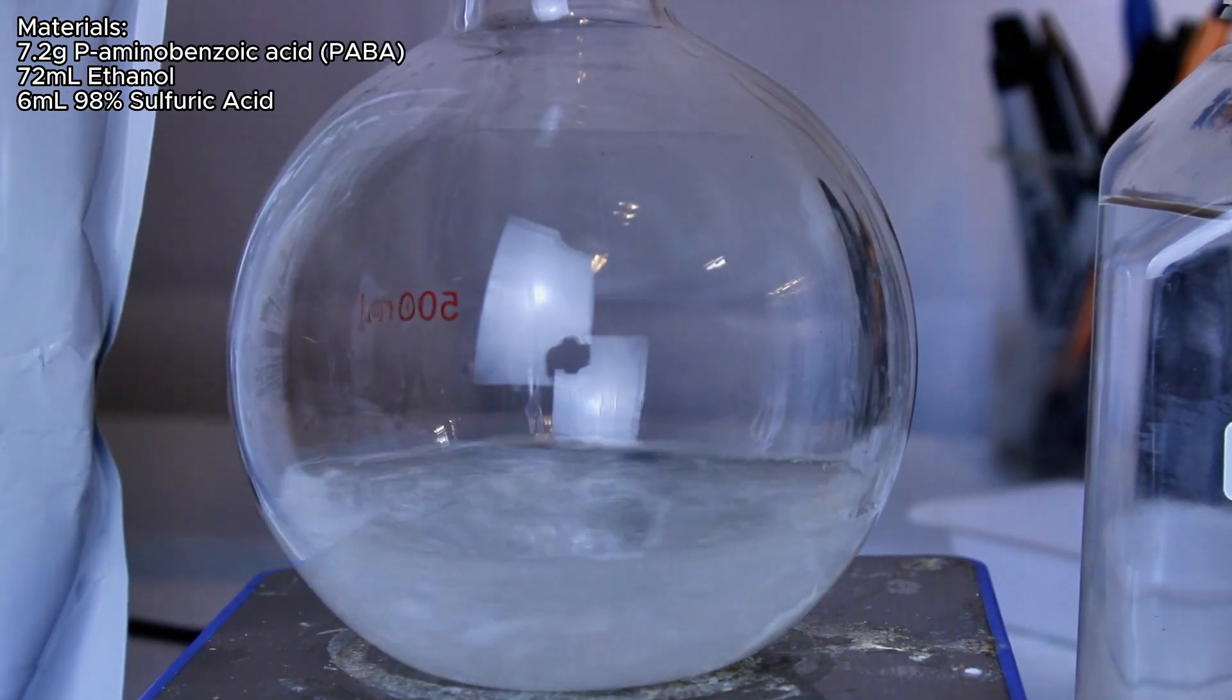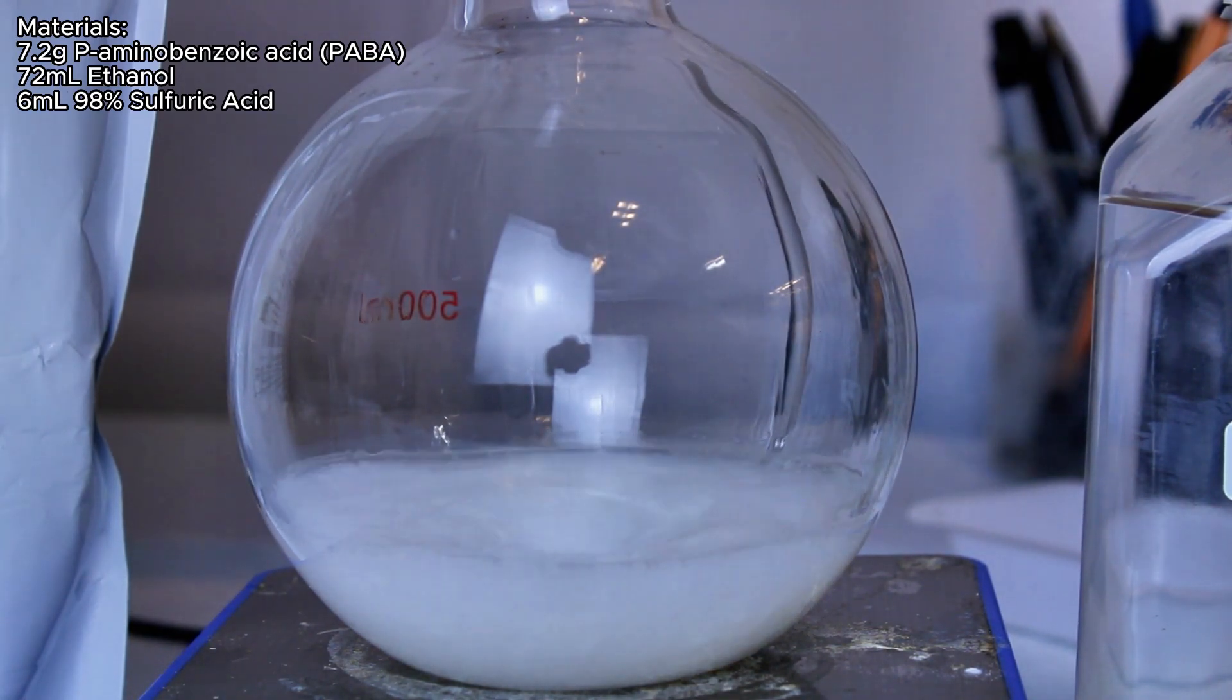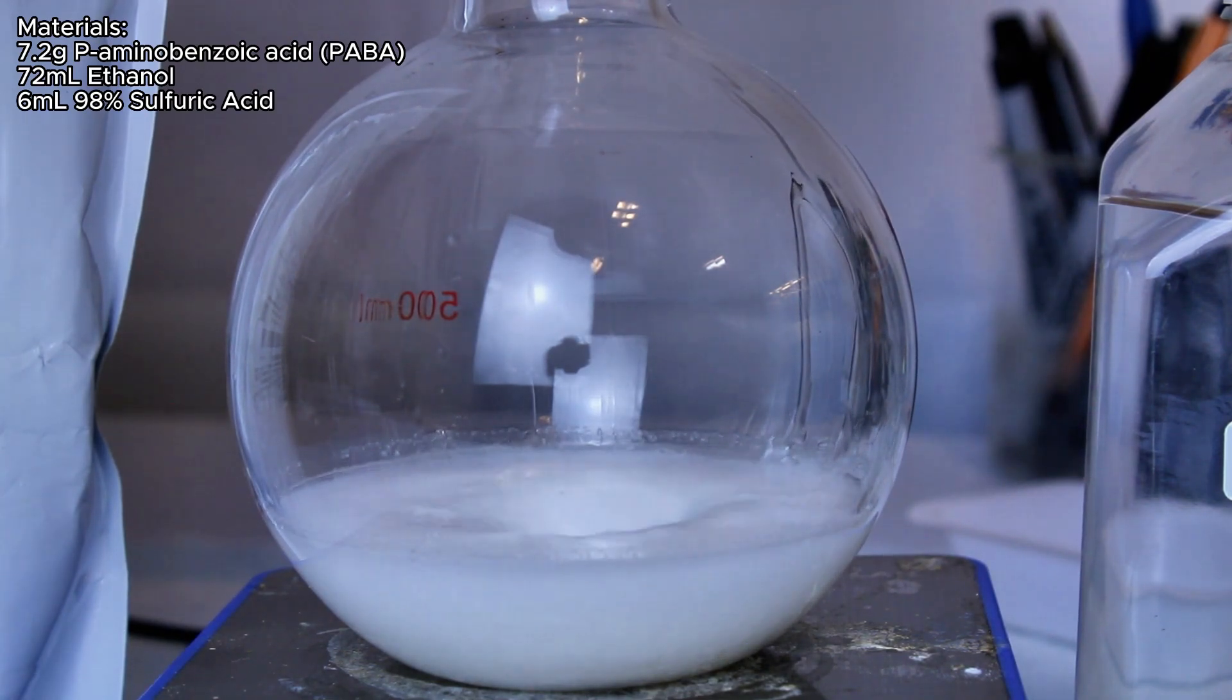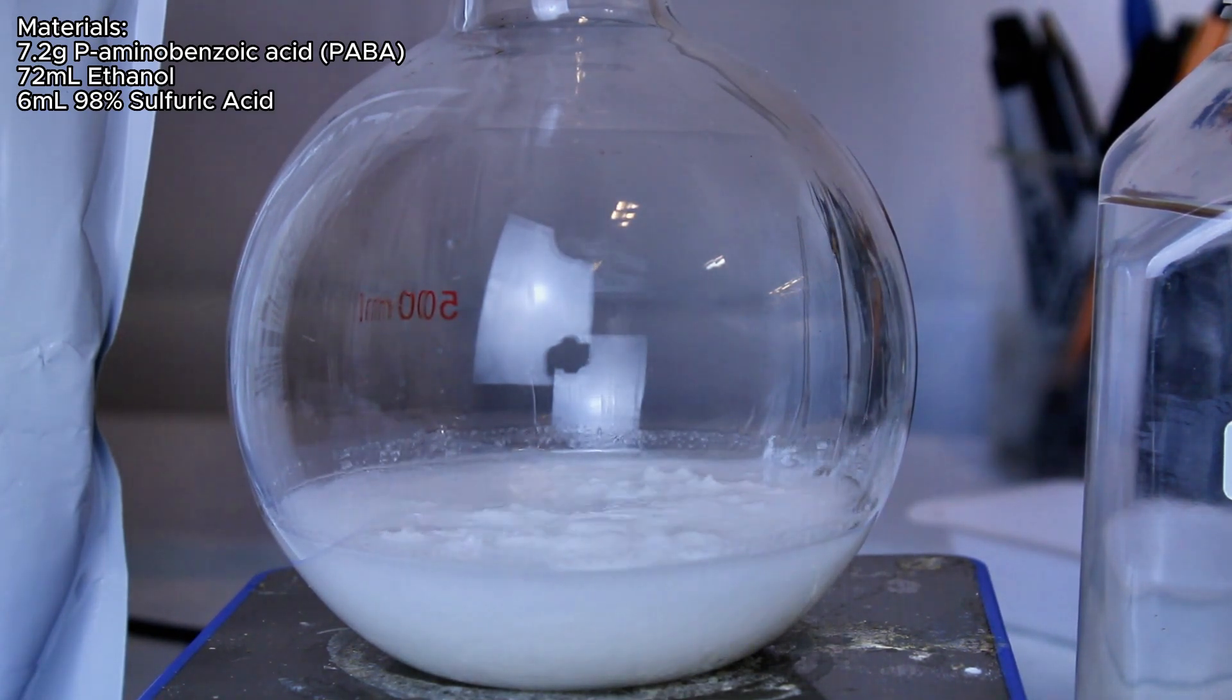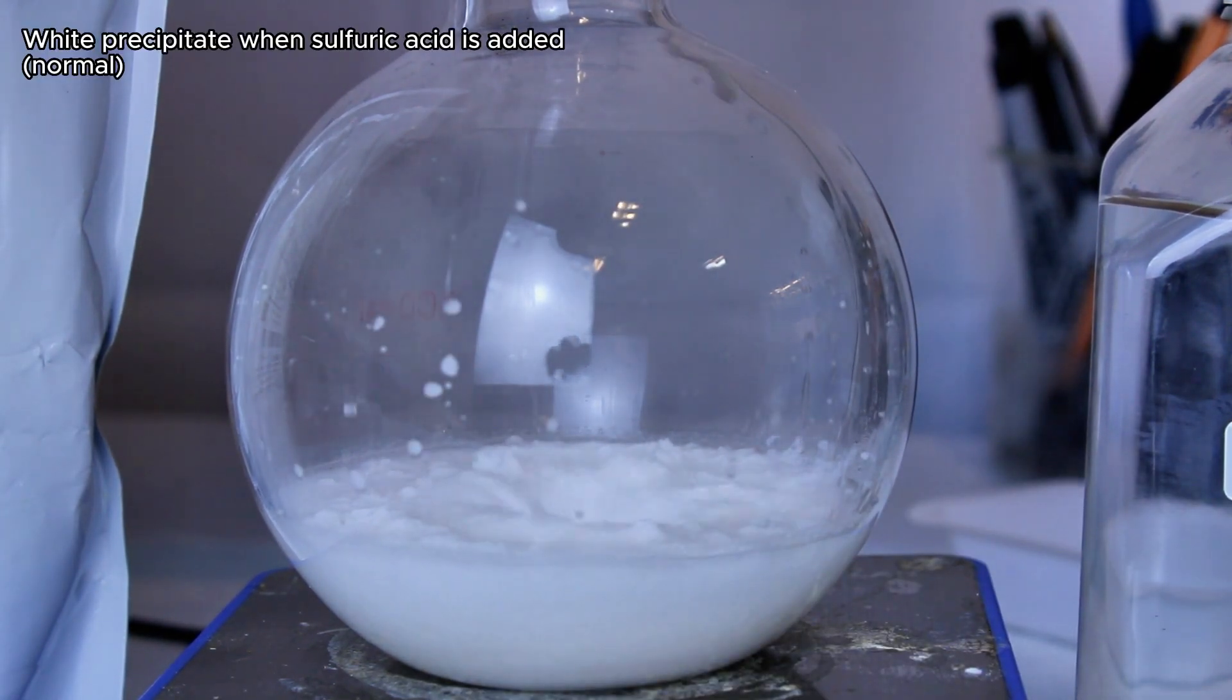To actually make benzocaine, what I want to do is add 7.2 grams of the PABA and 72 milliliters of the ethanol to a boiling flask. I then slowly and under constant stirring add my sulfuric acid. This is done because when sulfuric acid dissolves, it produces a lot of heat, and I don't want to boil away my ethanol.